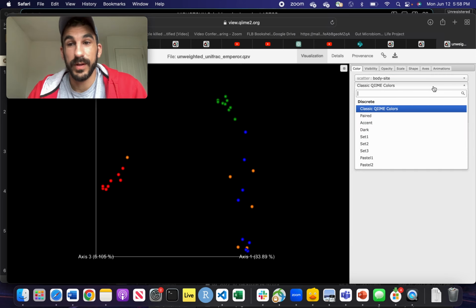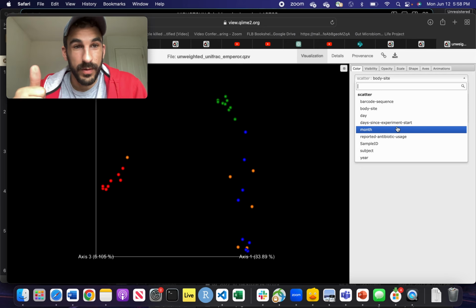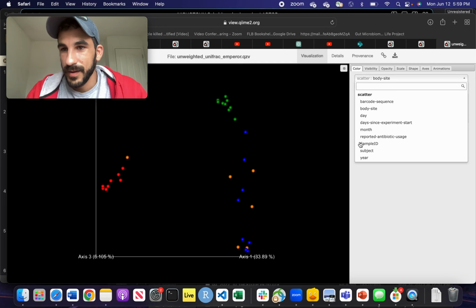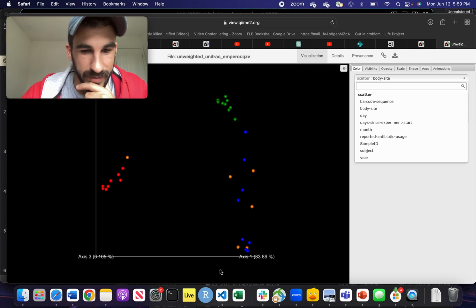So what you'll want to do is look at as many factors as possible. Probably the first one I would look at is order and family, and see how that clusters, and then diet. Those are the three big columns that you want to be interested in, because that's likely going to show some separation, like herbivores, carnivores, or like felids and canines. If you're looking at mammals, you'd expect them to cluster together. So those are the first kind of figures that you'll want to do. Every time you make a new figure with new colors, take a screenshot of it, because I think the first step is you're going to just screenshot a lot of these figures and send them to me in some kind of document, and we can make a decision off of that.